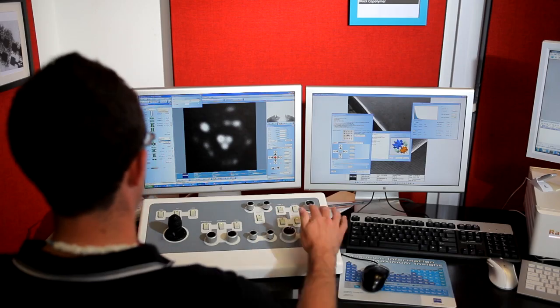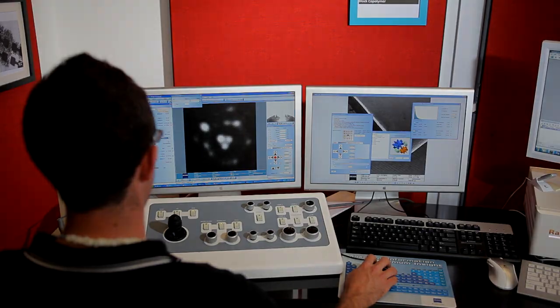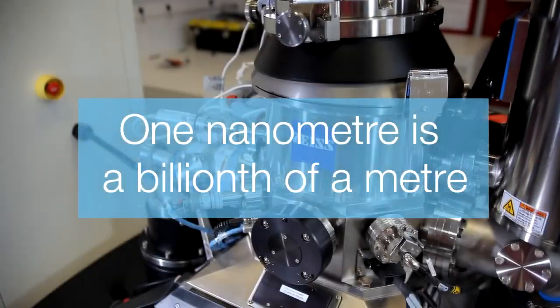The resolution of this machine is 0.35 nanometers. You're now approaching, sort of looking at individual atoms.